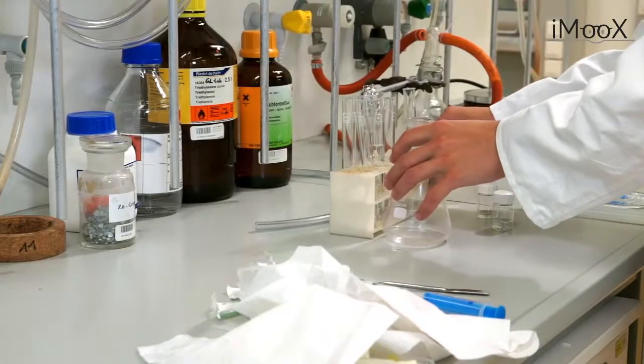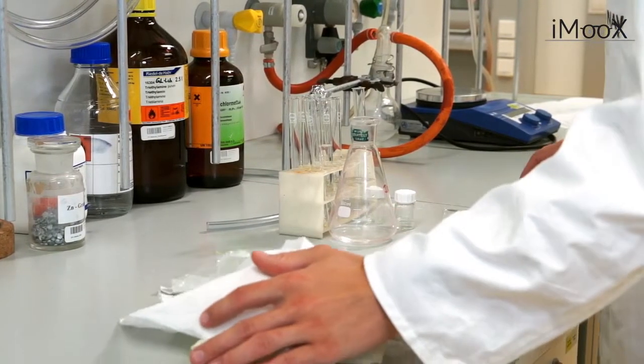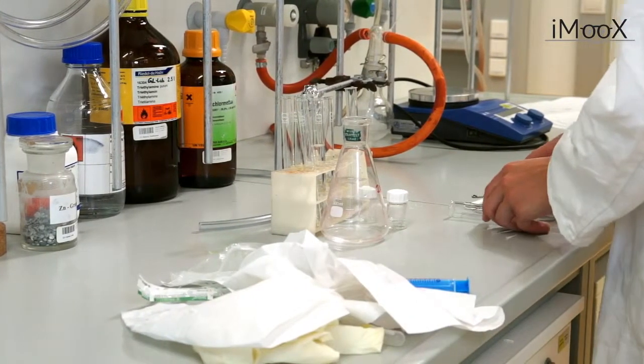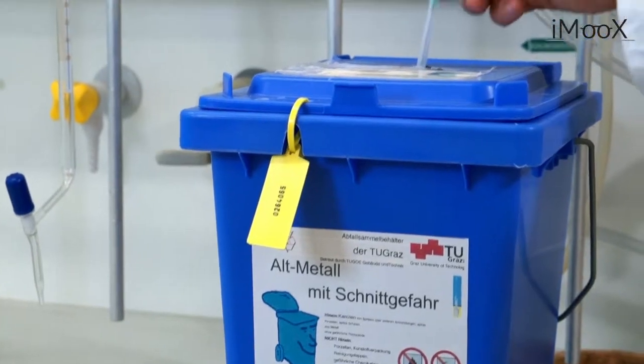Now you should clean up the bench and dispose of any remaining chemicals and waste. There are special containers for the different kinds of waste. For example, there's the container for sharp objects, or for solid chemical waste.